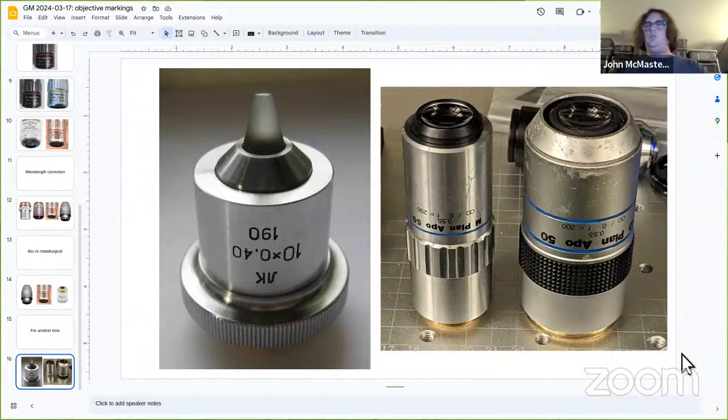That's a solid immersion lens that I got on the left recently. I'm quite excited to play with that. And on the right are more advanced illumination modes like dark field. So I think these would be a fun topic, but probably out of scope for today. So I would ask if you have any closing questions, comments, or if any of the viewers do. Otherwise, I would say that's probably a good stopping point for today.